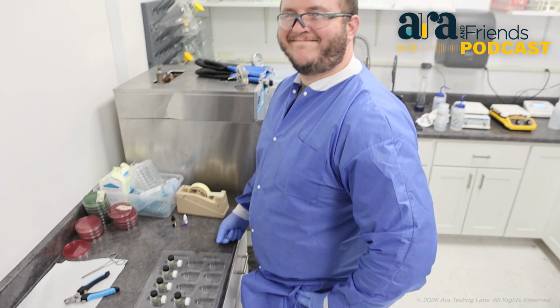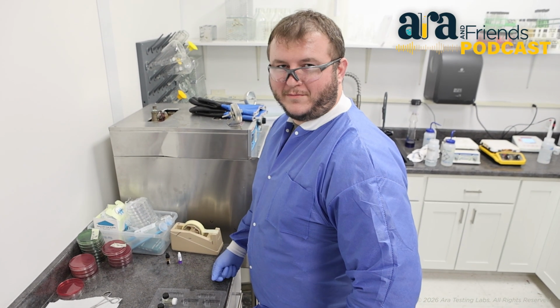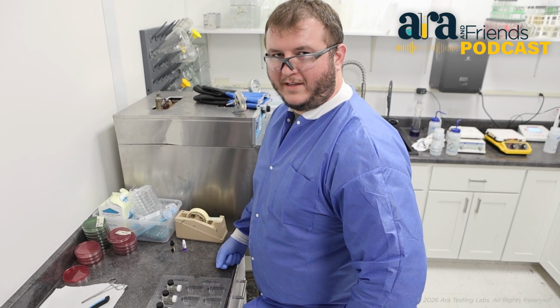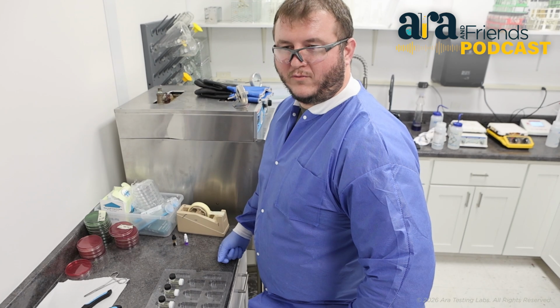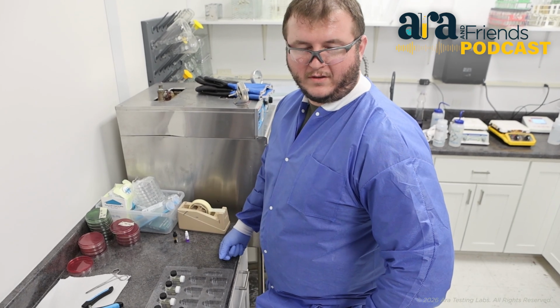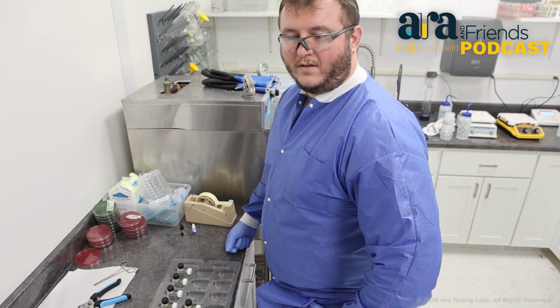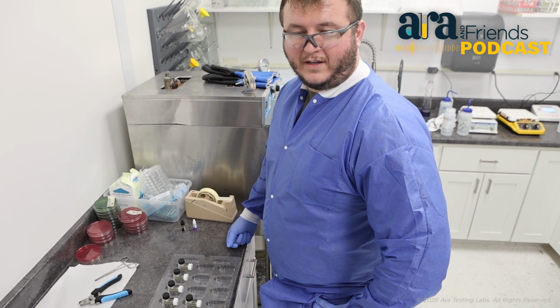Hi, Tommy. What are you working on today? We're going to do some salmonella 1-2 tests. It's just a presence-absence test for salmonella. We'll take a sample incubated overnight in TSB. We're going to put in these tests and see if it has salmonella.